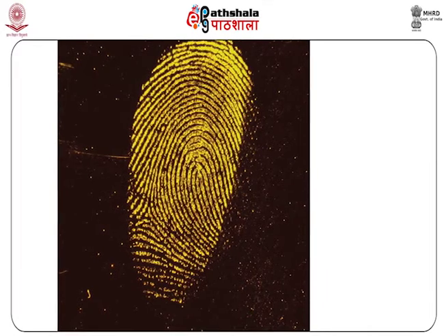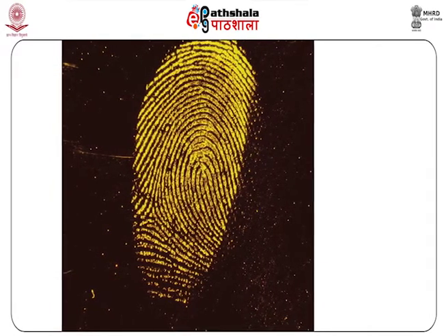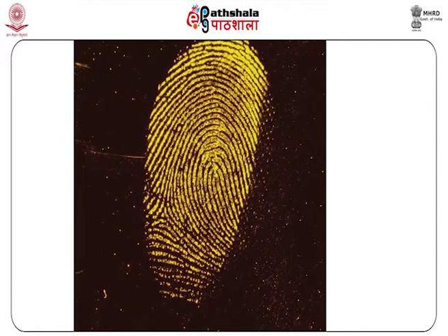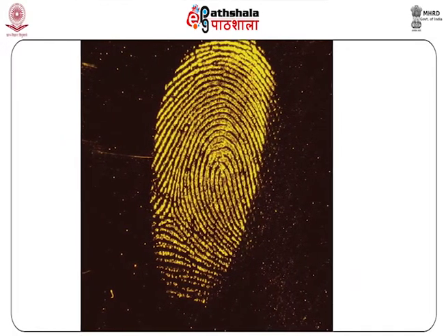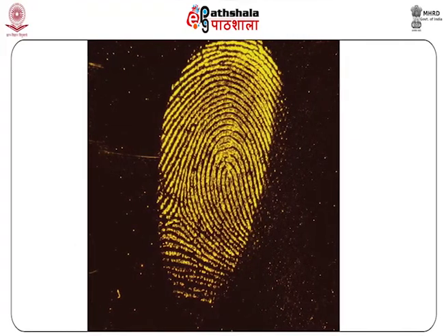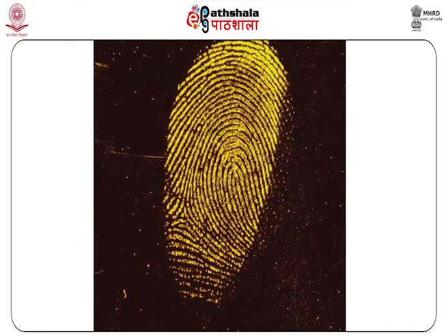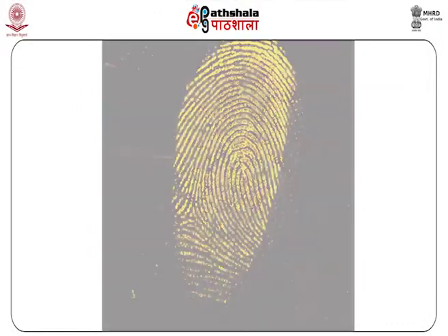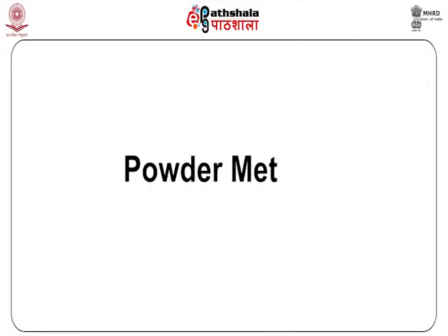In this procedure, the finger impression is treated with a laser active substance which becomes physically adsorbed on the sweat residue. When illuminated with laser light, the ridge pattern produces a contrast against the background. Number 1 is the powder method.